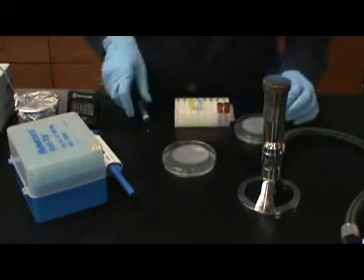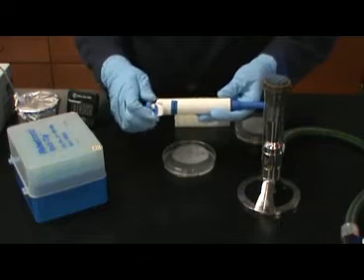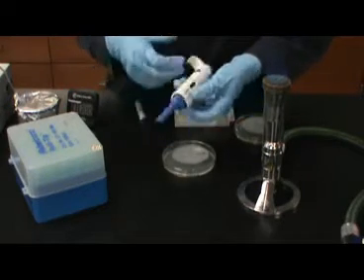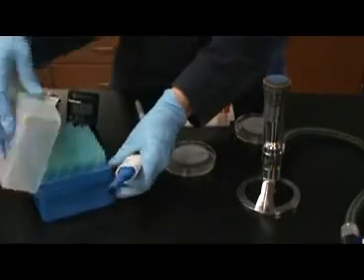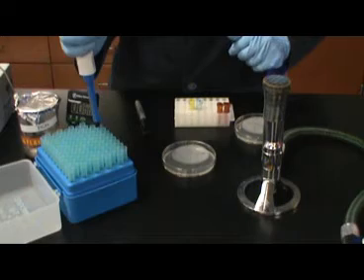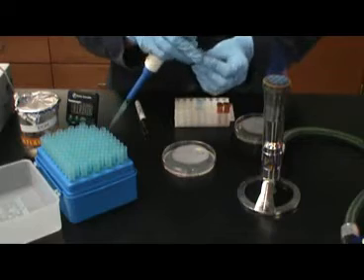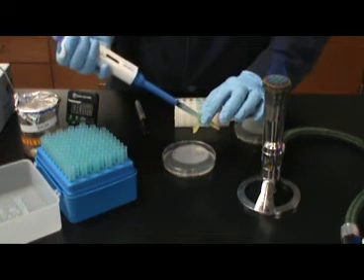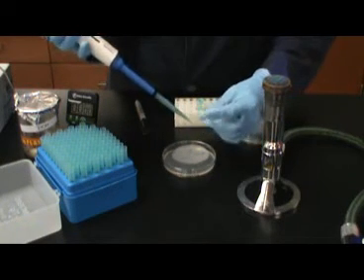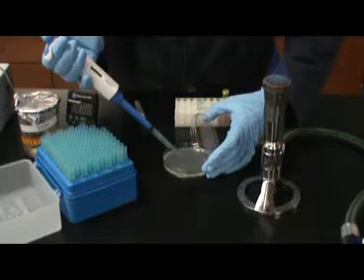Again, notice that we are first handling the negative DNA. For this part of the experiment, you will also need the 100 to 1000 microliter micropipette. It should be set to 500 microliters. You will dispense 500 microliters from the negative DNA tube into the nutrient agar ampicillin plate labeled negative DNA. Do not touch the tip to the agar surface.